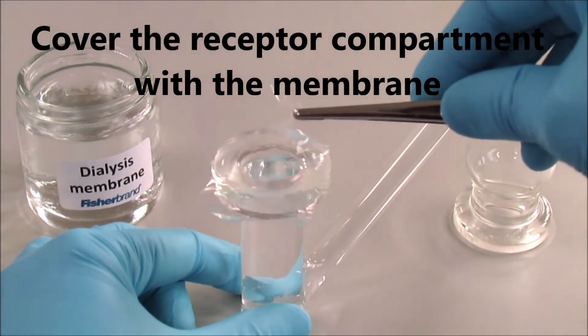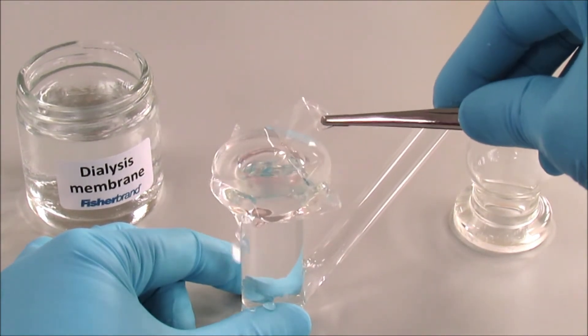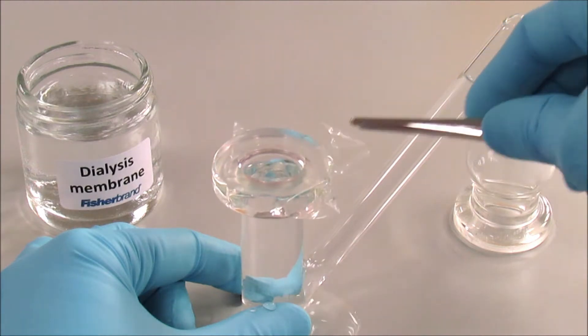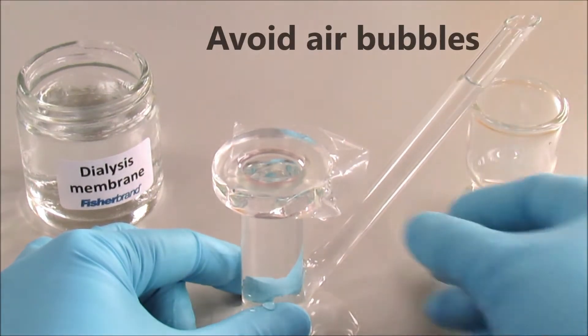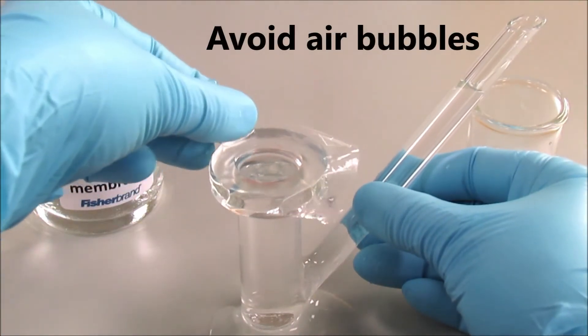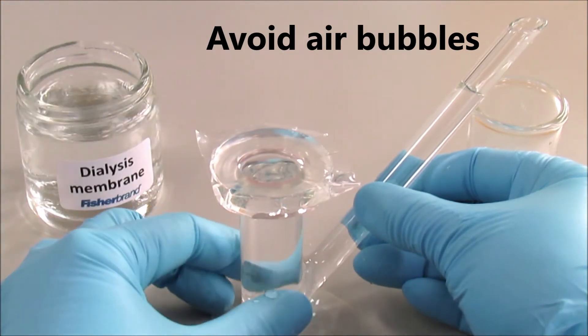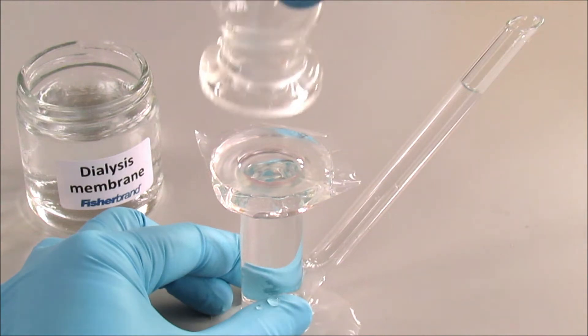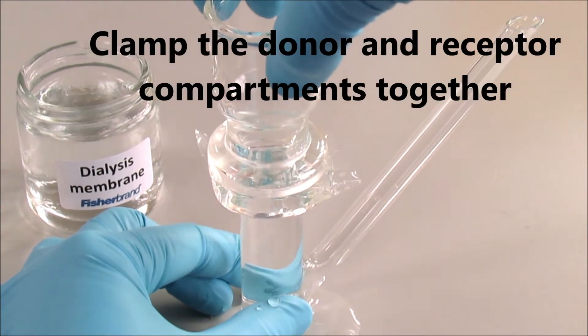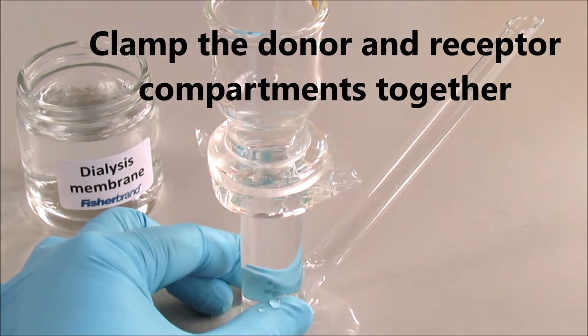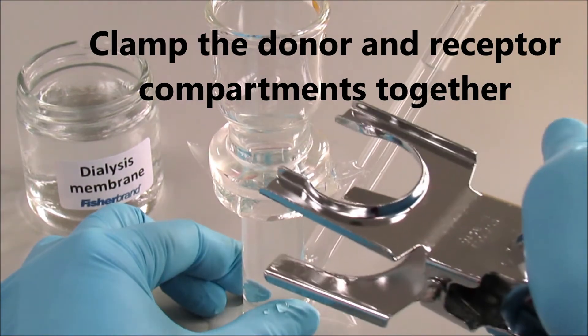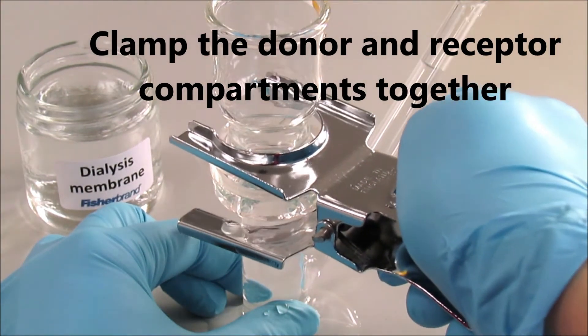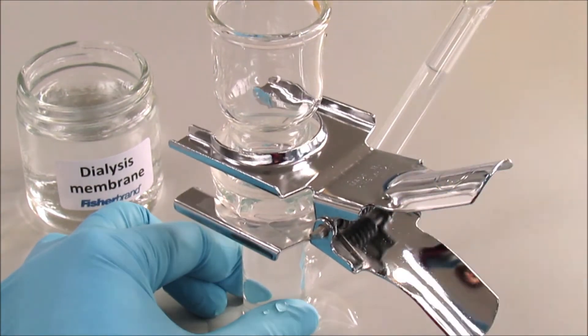We need to ensure that air bubbles are not trapped underneath the membrane. Then we place the donor compartment on top and clamp them together. These two compartments should be perfectly aligned.